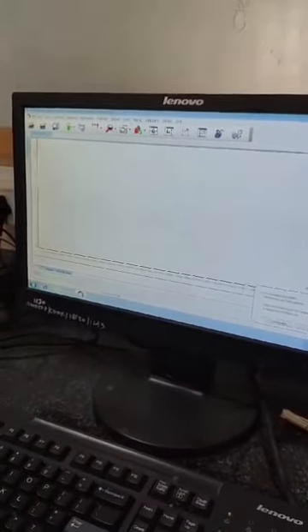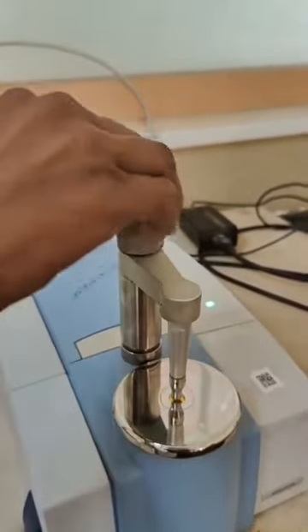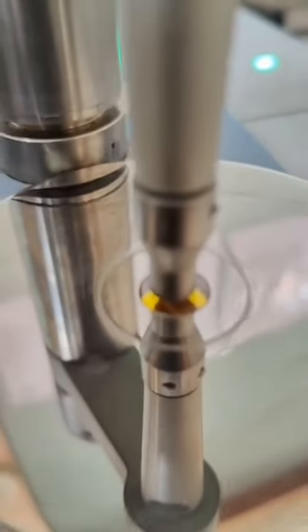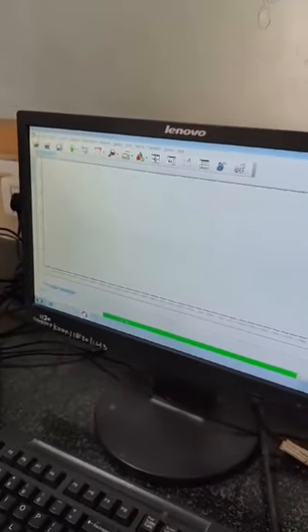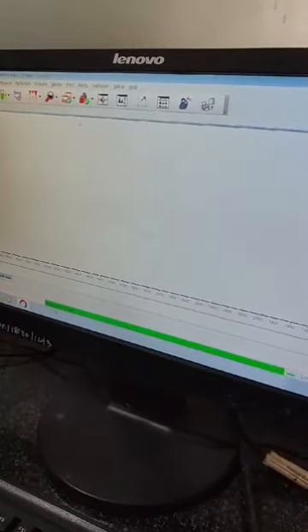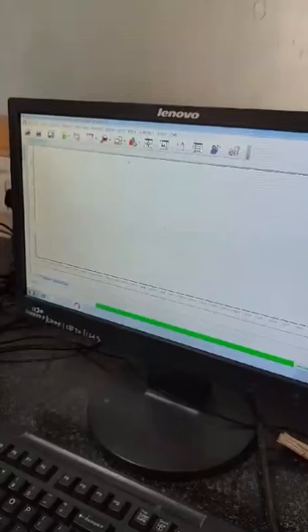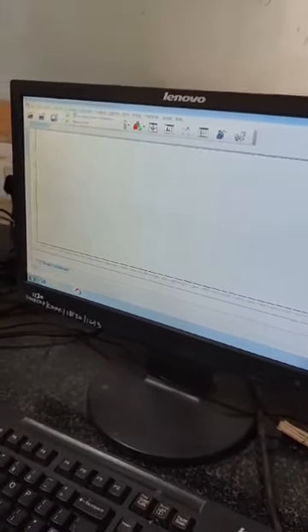Next, we measure the background. The instrument starts the background scan. Be careful not to touch the crystal knob — this is a very expensive crystal costing at least 1.5 lakh rupees. Now I will click on 'Measure Background.' You can see in green color the background scanning has started — scan 1, 2, 3, 4 — and the progress goes 25%, 29%, and so on. This is similar to a blank reading.